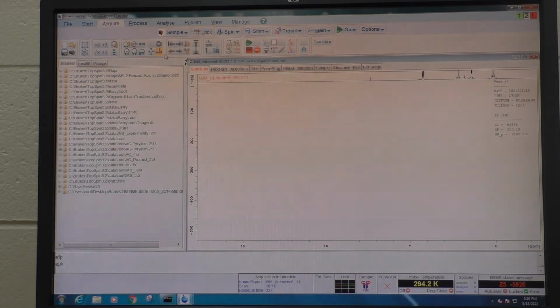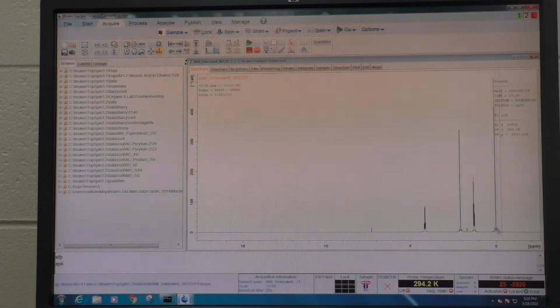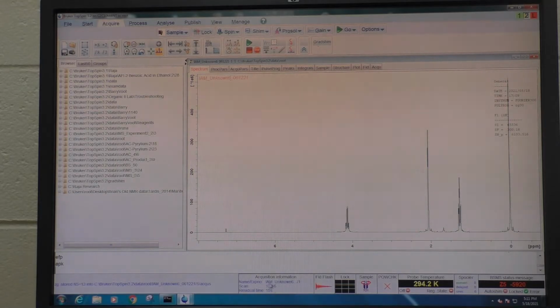And then it gives me my signal. Well, that's up there, so let me briefly just bring that down. So now we can see my spectrum. I can zoom in on it just by clicking and dragging. And we'll do spectral analysis here in a little bit, but the spectrum is still running. We're still acquiring scans. The way to accumulate those scans is simply to type EFP again after they have finished acquiring. And this will then collect all of them. But this allows us a quick sneak peek at what the spectrum is going to look like.